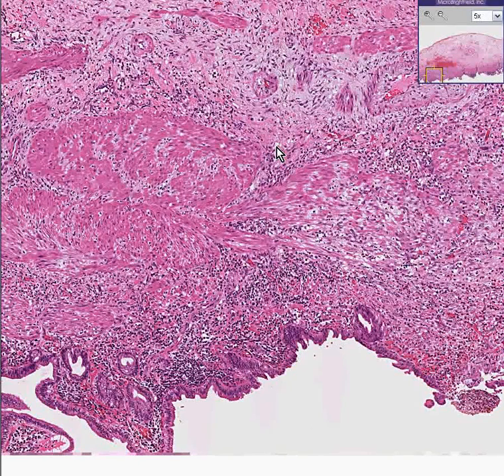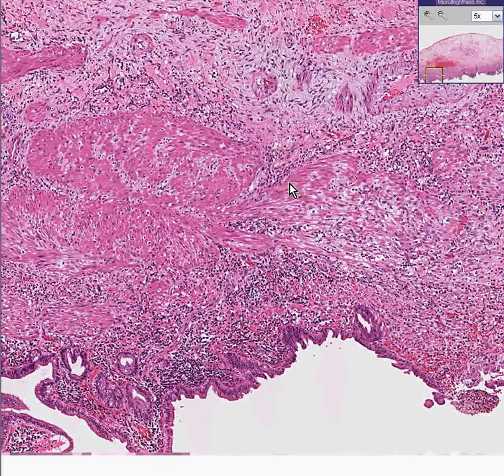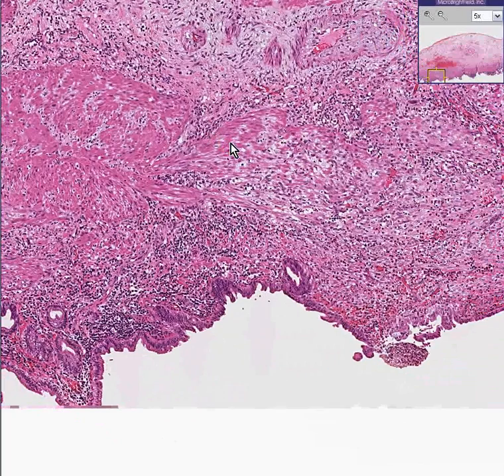Another little tip, chronic cholecystitis and gallstones go together like bread and butter. Each one predisposes to the other in every way. So when you think chronic cholecystitis, think that it could give rise to stones. If you see stones, know that they're very highly associated with secondary inflammation as well.